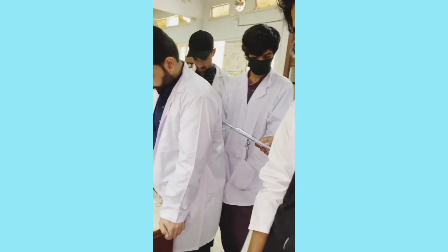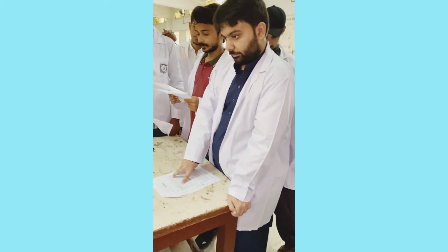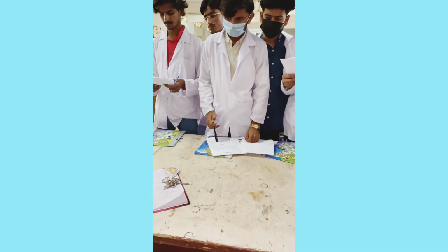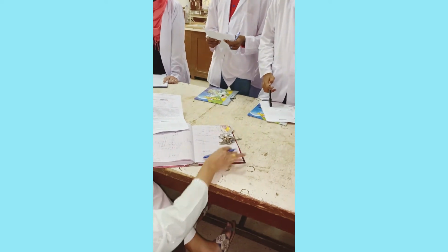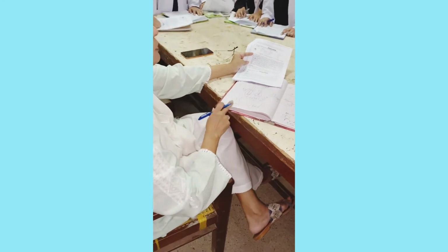Okay. After the addition of the entire mixture of acid, remove the flask from the ice bath and allow it to stay for 1 hour. Now you will take it out. After doing this, you will take out this flask containing your mixture and let it be here for 1 hour. Now what you are going to do in 1 hour, you are going to prepare your journal, experiment, and this format and everything, reaction mechanisms, everything you are going to do. You will complete this thing in the meanwhile. For 1 hour you have to leave it.